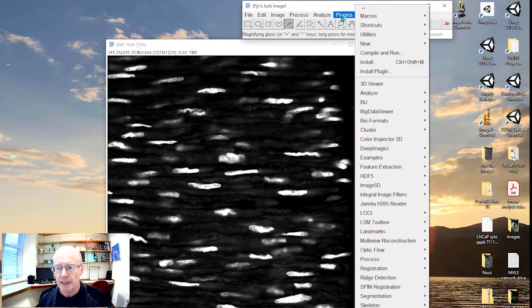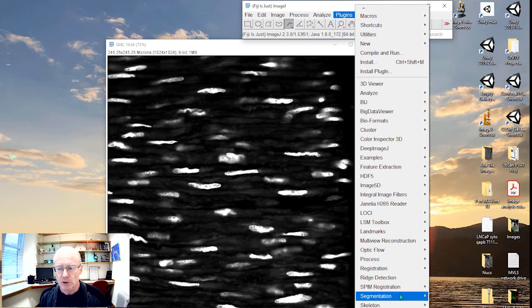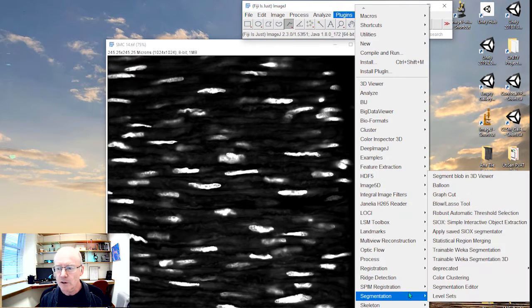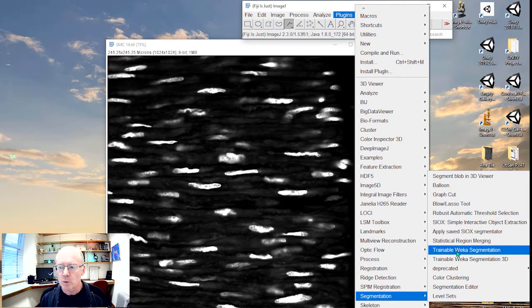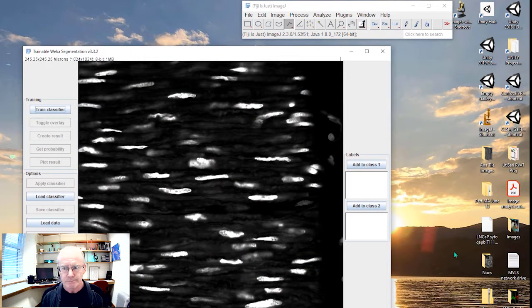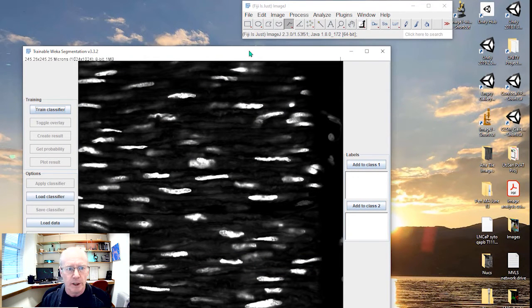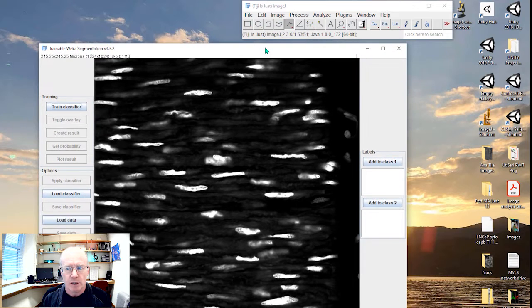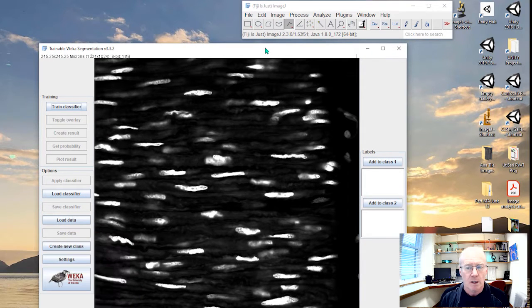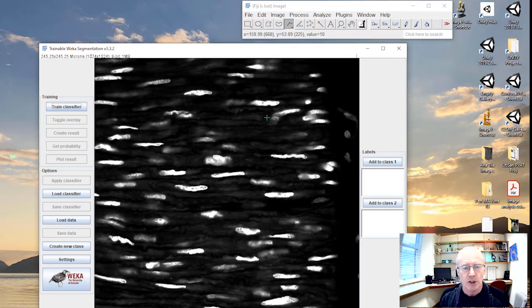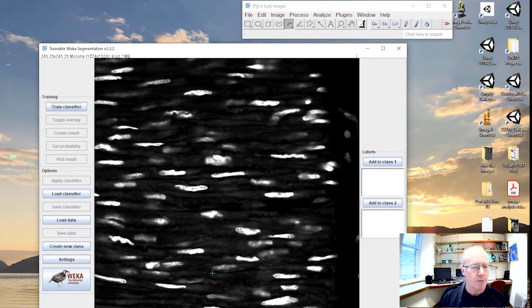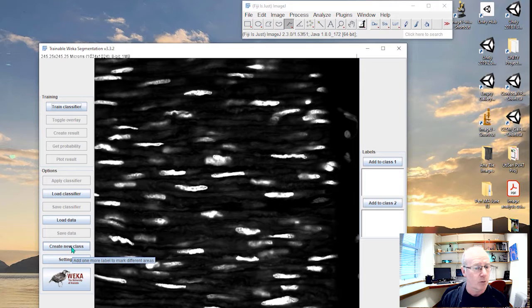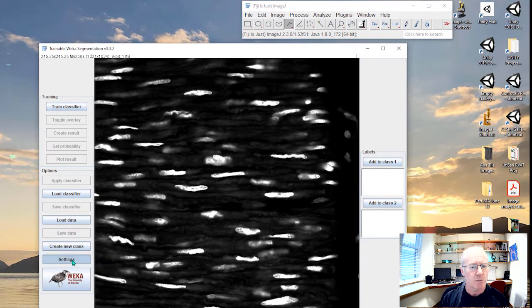So we'll go to our plugins. We will come down to segmentation and we're going to use the trainable Weka segmentation. And as you see, it pops the window into the trainable segmentation window. Now at the moment, it allows us to identify two classes of objects in the image. We could go to the settings where we could create a new class if we wanted three classes, but we'll just keep two.